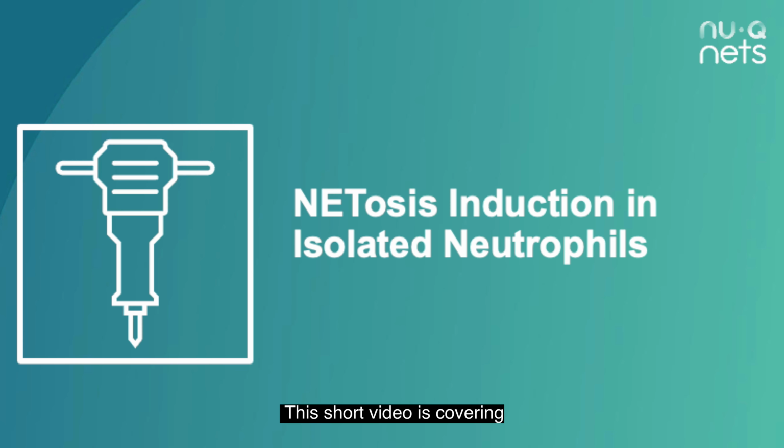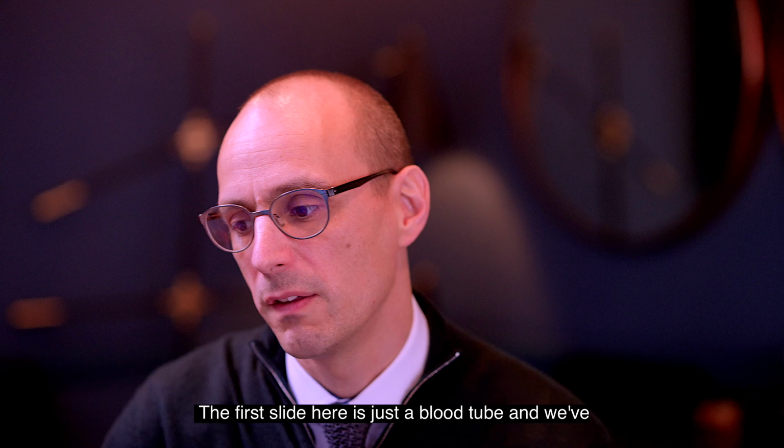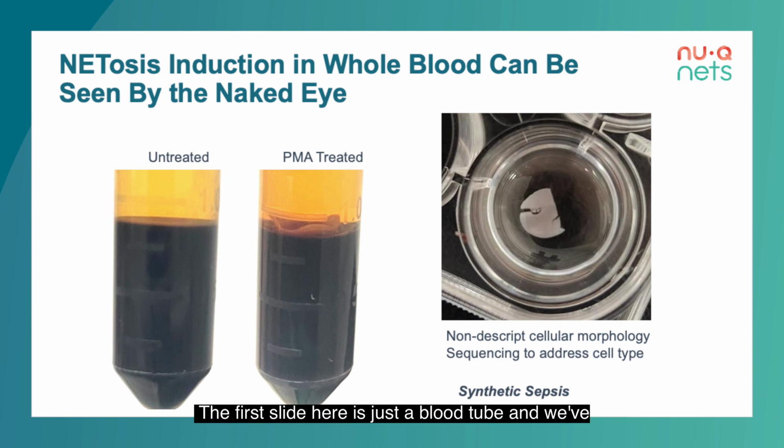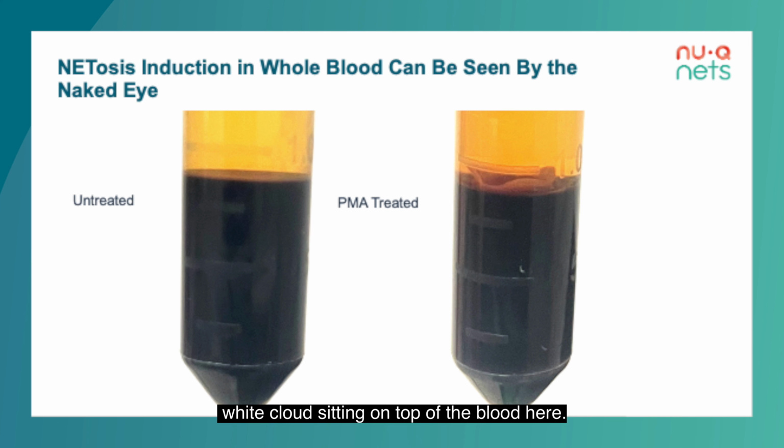This short video is covering NETosis induction in isolated neutrophils. The first slide here is just a blood tube, and we've just let it stand and we've added PMA to it. What you can see is this sort of white cloud sitting on top of the blood here. Even with the naked eye, you can see this nondescript cellular material at the top. This is NETs being released after stimulation with PMA.